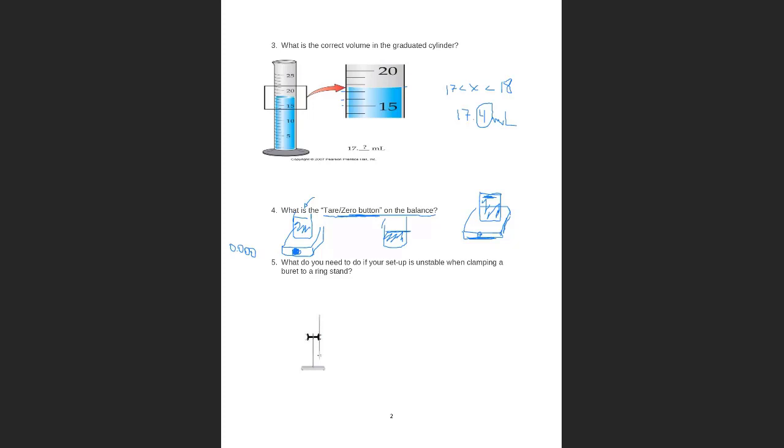And look at this question. There are three videos. One is talking about the balance, watch it. The second one is talking about the glassware. We went through that. And the other one is talking about different clamps. There are different pieces of equipment. Some clamps are to support a filter funnel. Some are to place clay triangles. So watch that. But here, what is happening is that this clamp holds the buret, and this is called a ring stand.